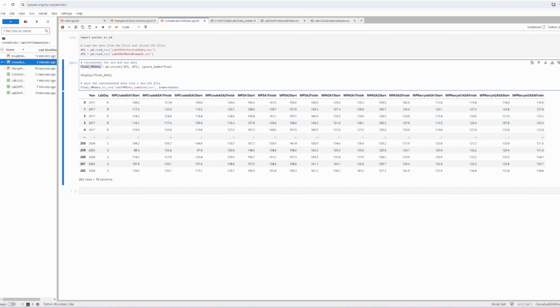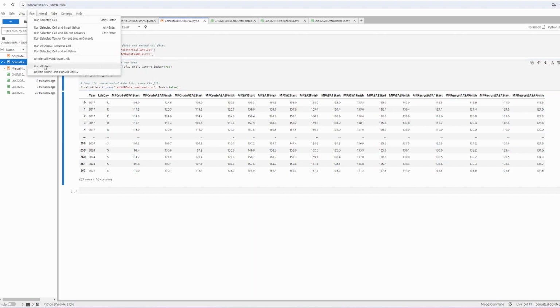But there's our new data frame that we called in previous examples. So we can continue on with this one here and keep doing whatever data analysis we would like to. As well, we can save it to a separate file, and then you could open another window if you wanted to and just work on this specific file.